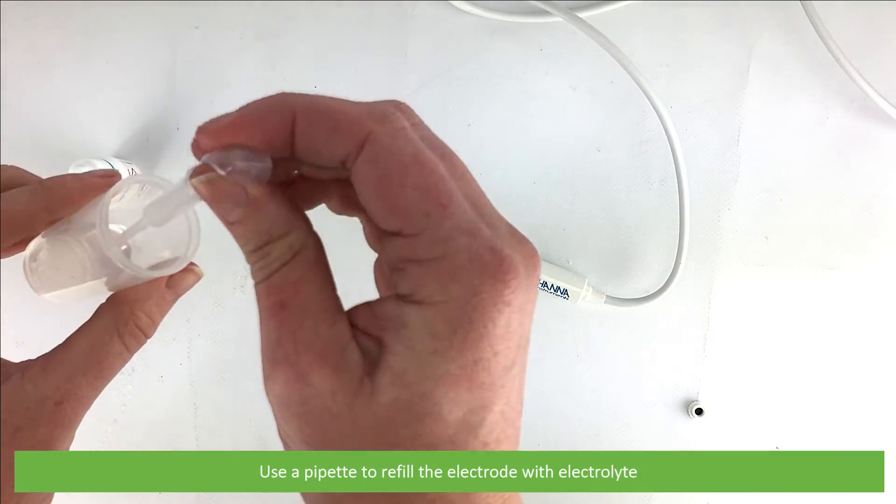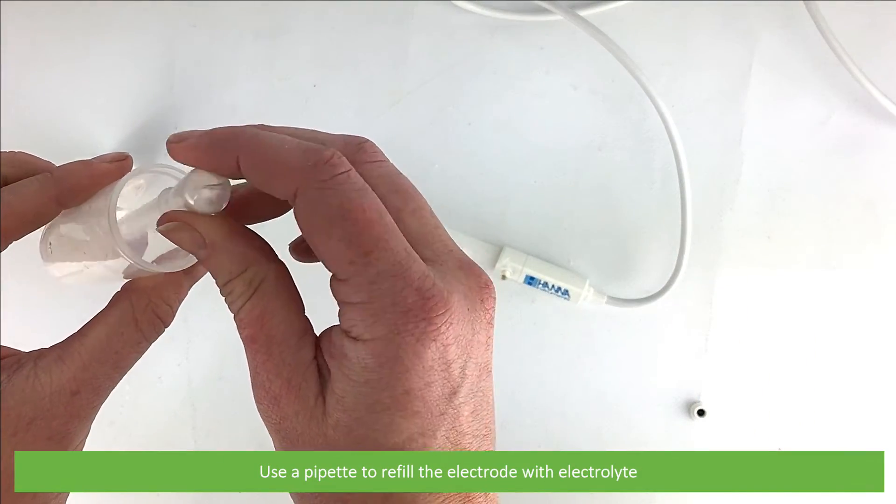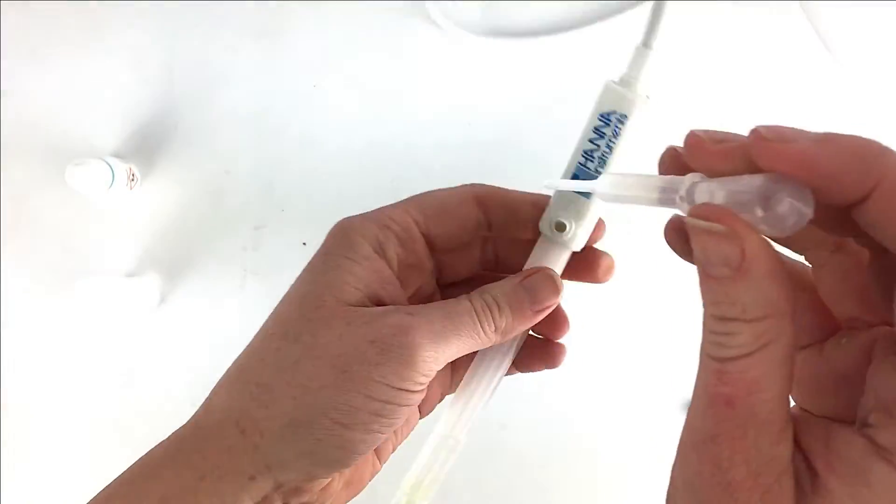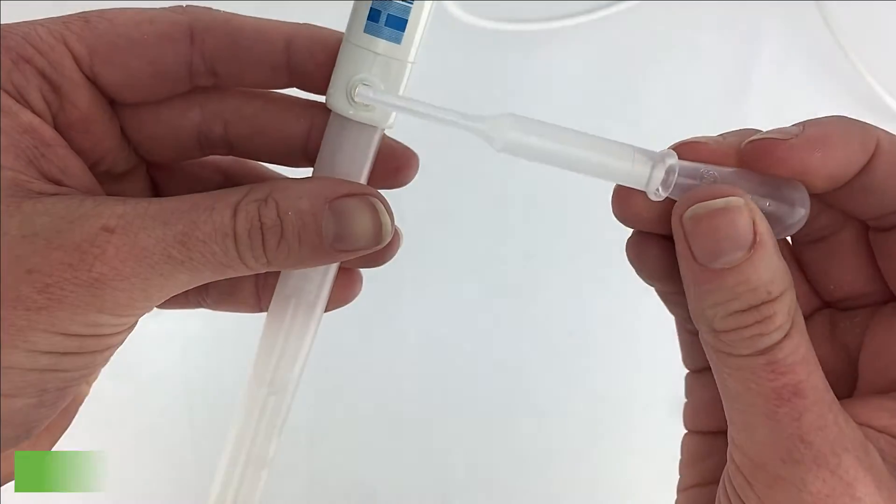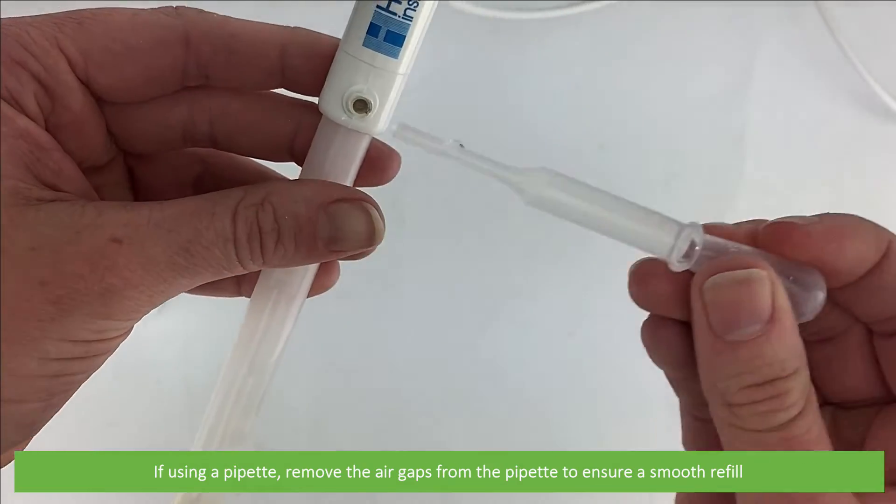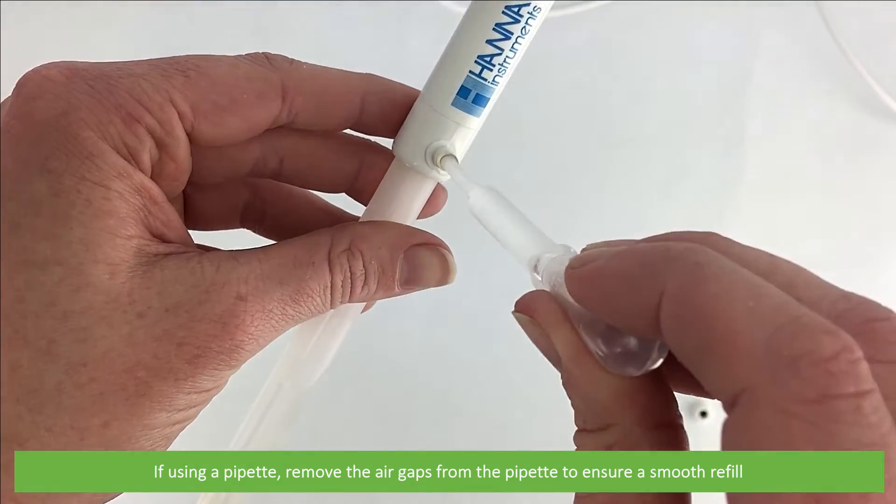Use a pipette to refill the electrode with electrolyte. If using a pipette, remove the air gaps from the pipette to ensure a smooth refill.